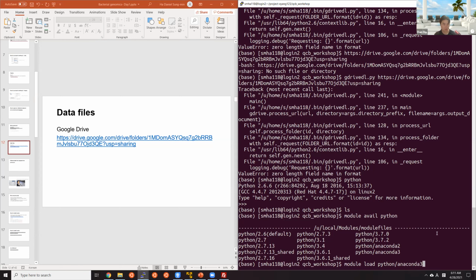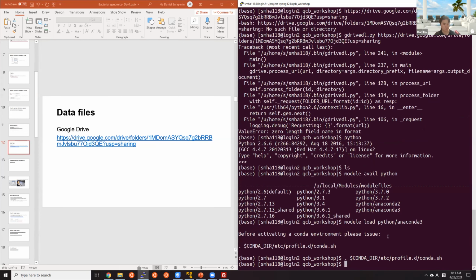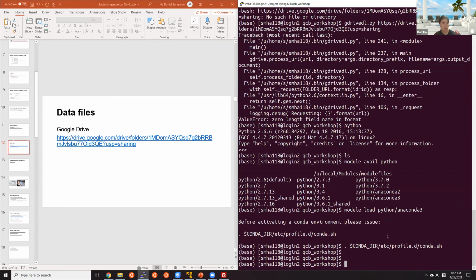I'm not going to explain the stuff about Anaconda just yet. It's going to ask you to type in this command, so let's do that: conda dir etc profile.d conda.sh, and let's see which python.